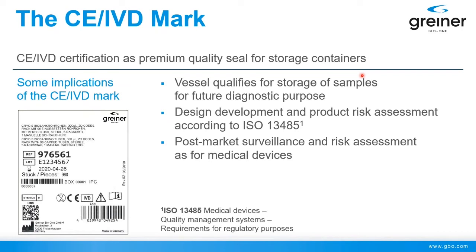So we suggest ISO 13485, which is the norm behind it. It guarantees two things: you are safe for the future if you one day go into more diagnostic applications, whether it's really diagnosis or development of diagnostic tools, and it's just a very good quality seal you can apply today.